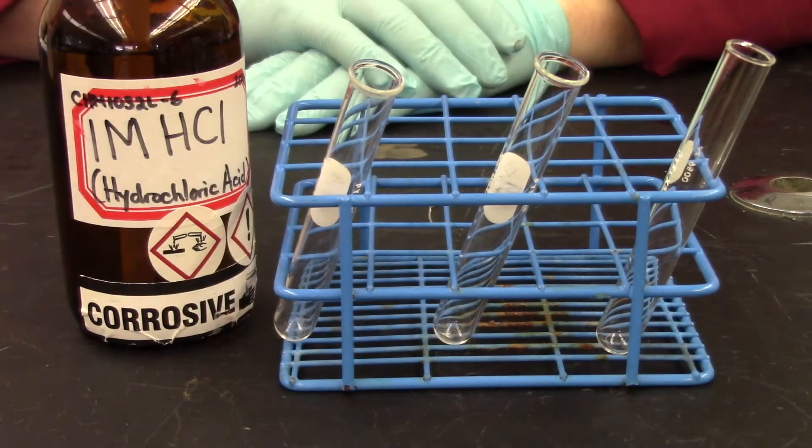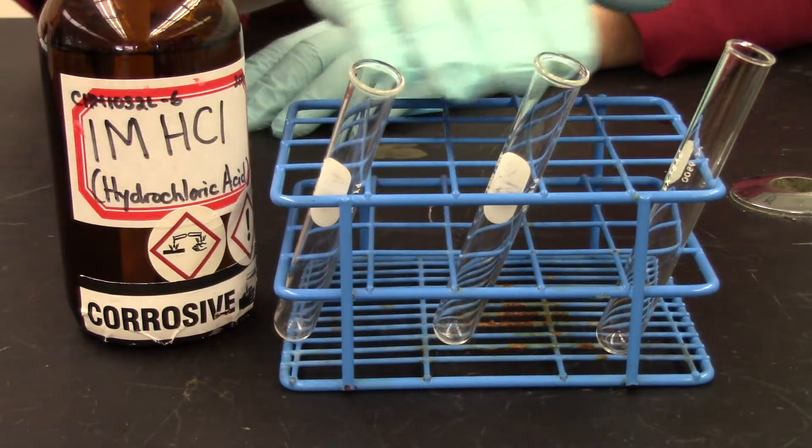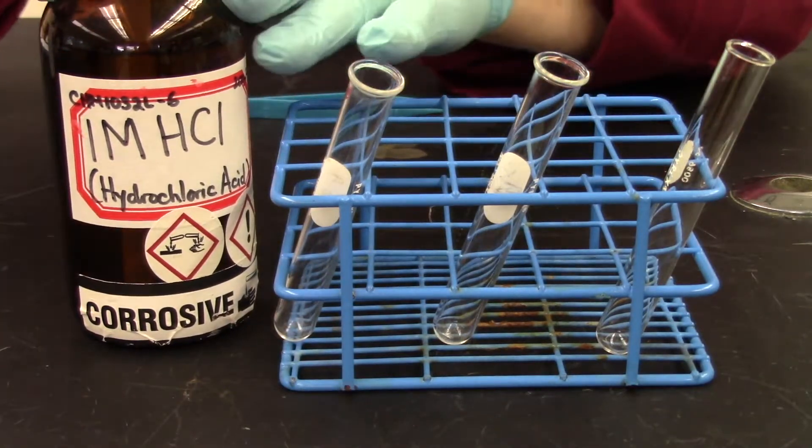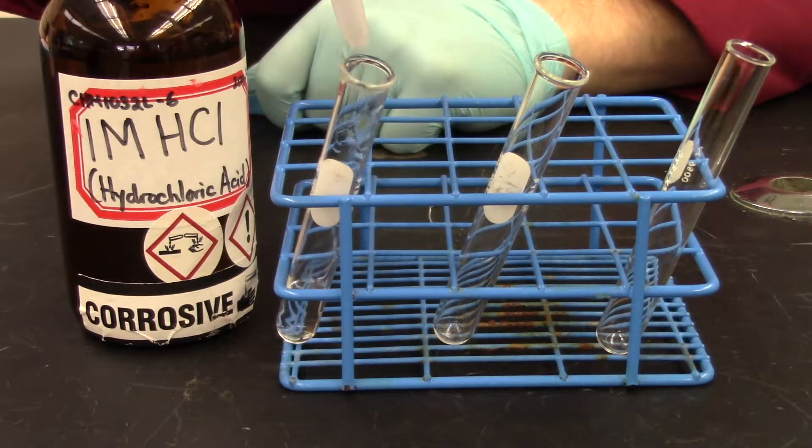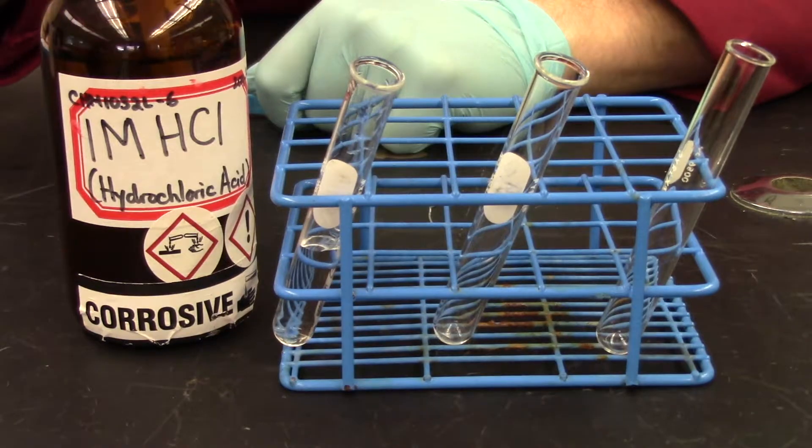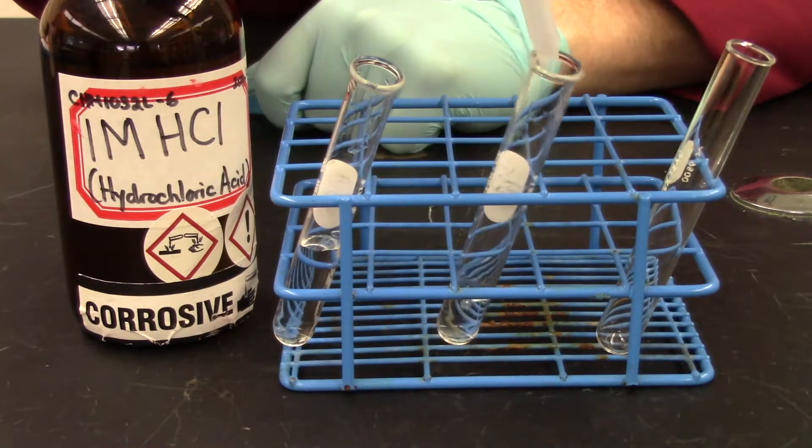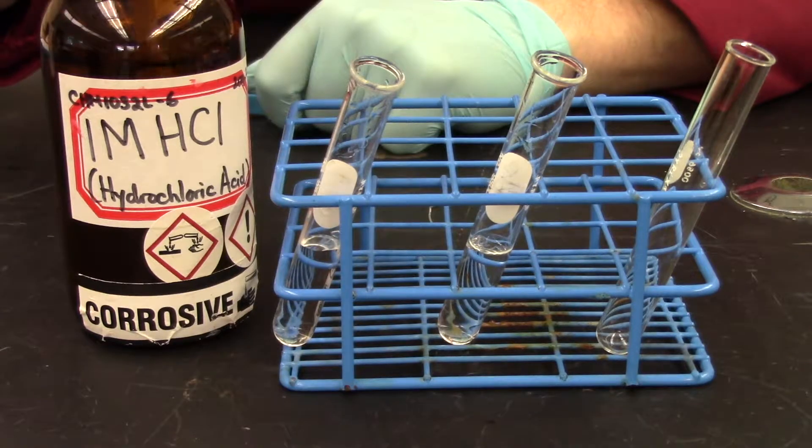In today's experiment, we'll be doing chemical reactions. Part one, reactions with metals. So what we're going to do is put some hydrochloric acid into each of these test tubes, about five milliliters. Now it doesn't have to be accurate. It's not critical that it's five milliliters precisely or accurately. Just enough to cover the piece of metal we're going to throw in there. So I'm just going to put in some acid.